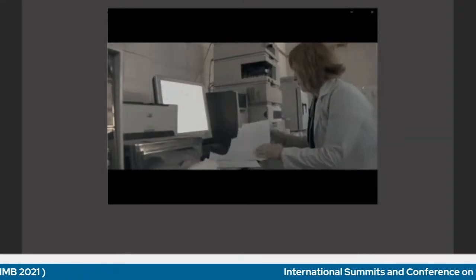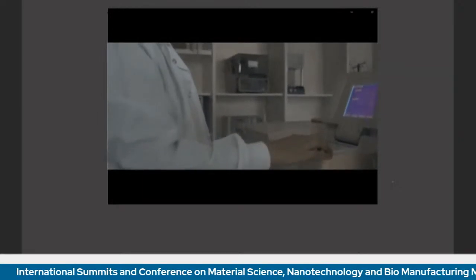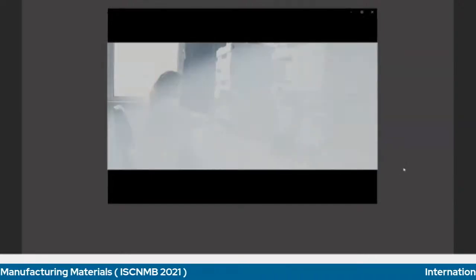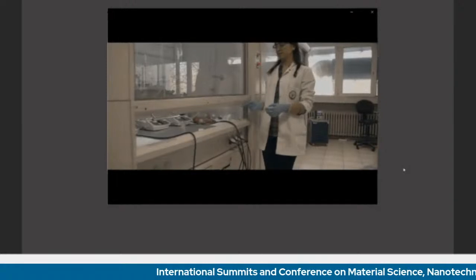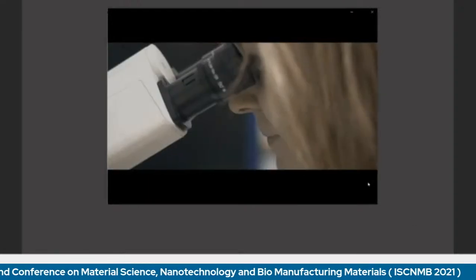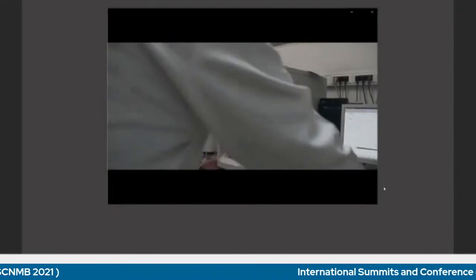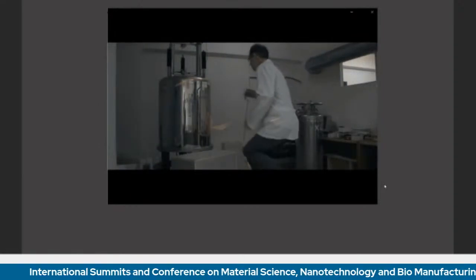The Central Laboratory 1, founded in 1996, consists of three units. HPTLC, UV spectrometry, IR spectrometry, HPLC, lyophilizator, polygraph, gamma scintillation counter, ultracentrifuge, GCMS, spectrofluorometer, and a microscope for advanced applications are the major instruments included in this laboratory. The Central Laboratory 2 was founded in 2004. 400 MHz NMR spectrometer, LCMS, and elemental analysis instruments are the major equipment of this laboratory.